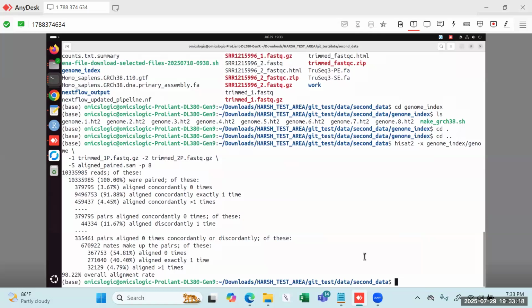After sorting, there comes the step of creating the count matrix, like the one that I showed you on Gene Expression Omnibus, which is GEO. That platform directly gave us the count matrix, where it talks about the gene expression values of the different IDs, the probe IDs, or the different genes that are present here, and it gives us the expression value.